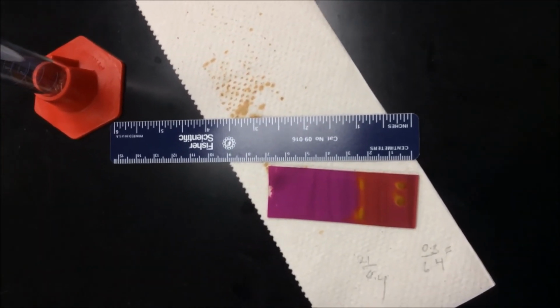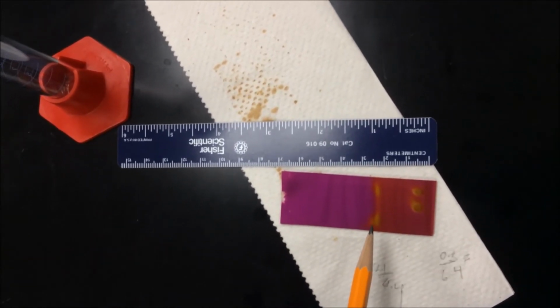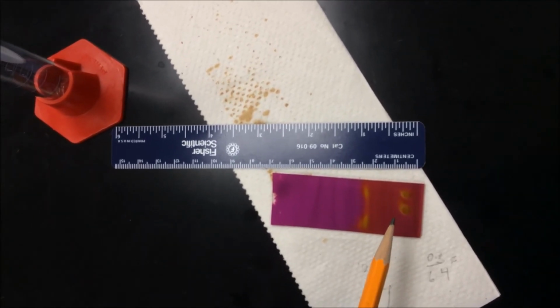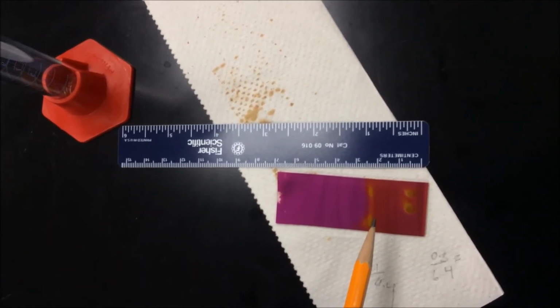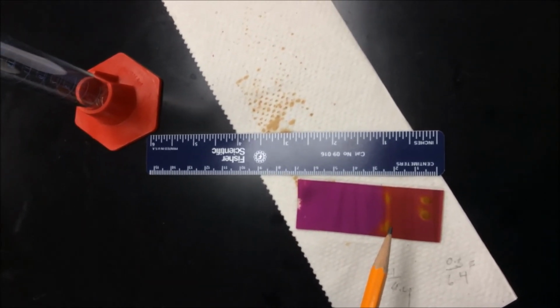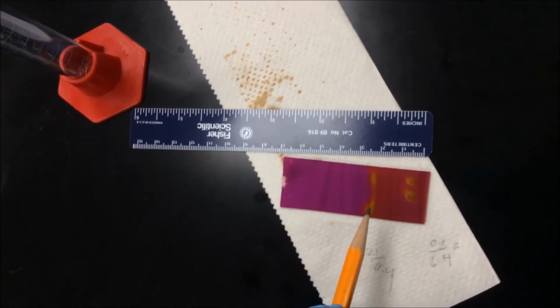So hopefully you can realize from here that orthonitrophenol is much more non-polar as compared to the metanitrophenol. Now it's your job to draw the structure for yourself and explain to yourself why it is that one is more non-polar than the other when both of those are basically isomeric molecules.